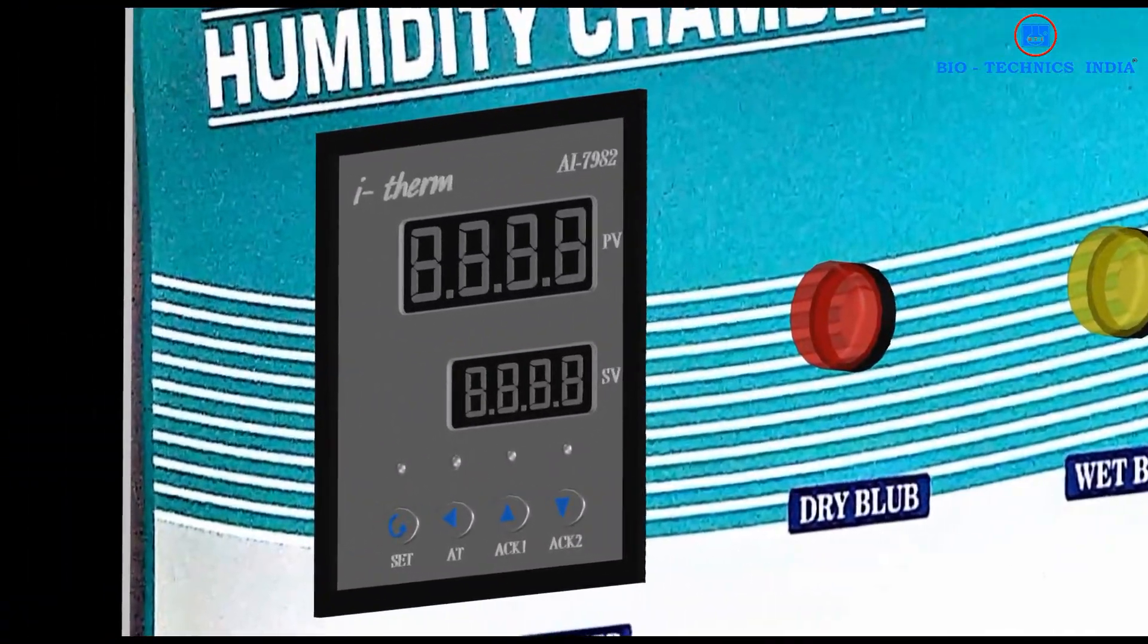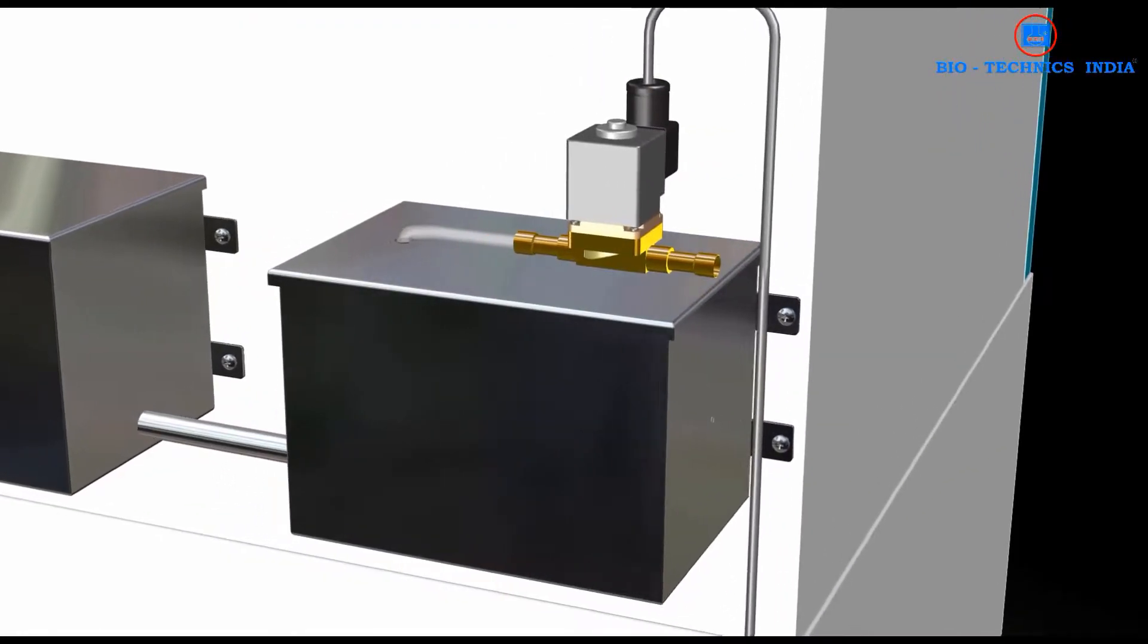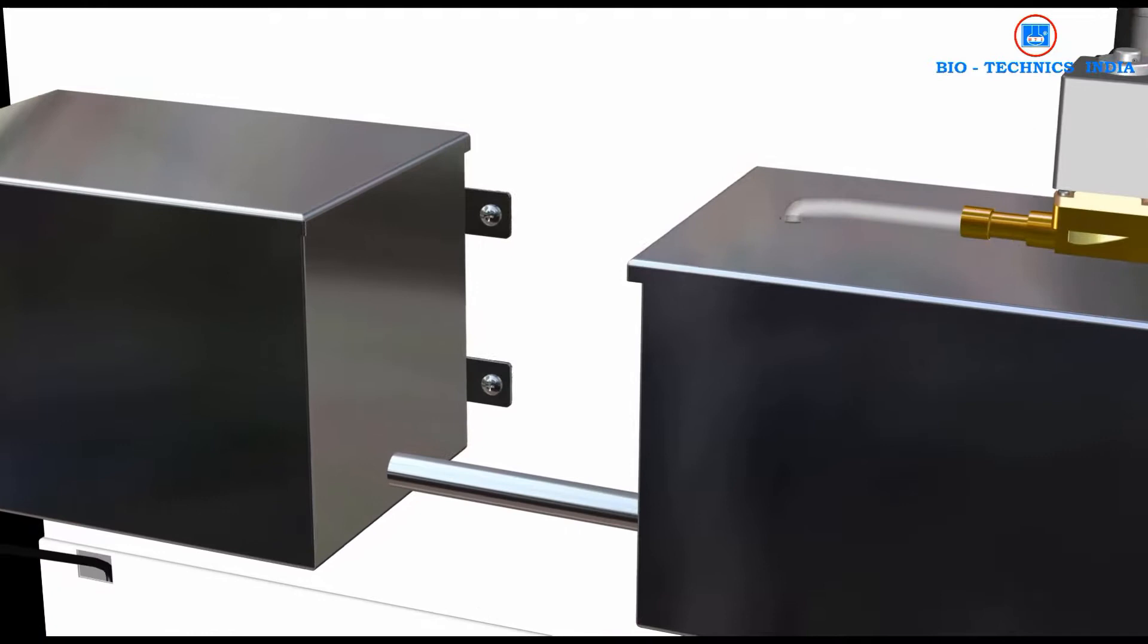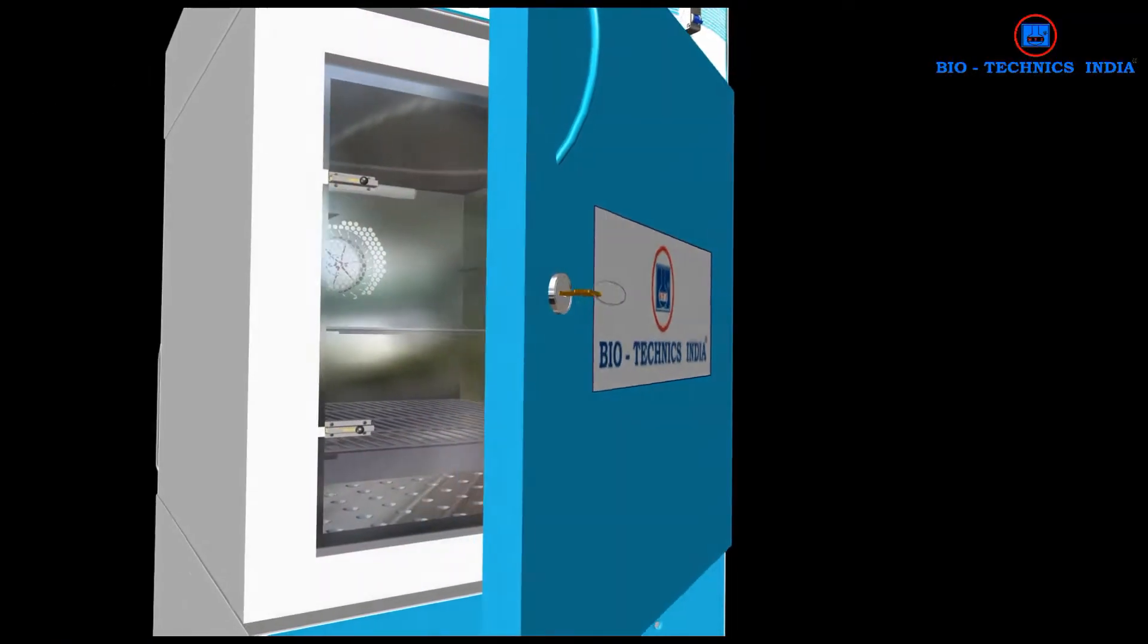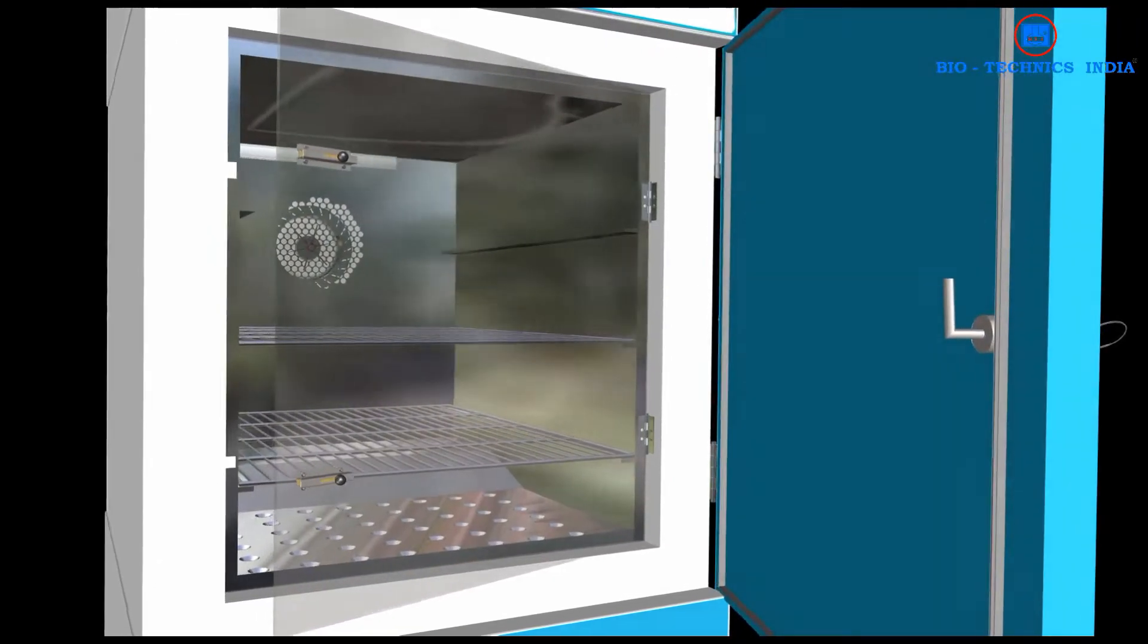A humidity chamber, also called a climatic chamber, is an enclosure used to test the effects of specified environmental conditions on biological items, industrial products, materials, and electronic devices and components.